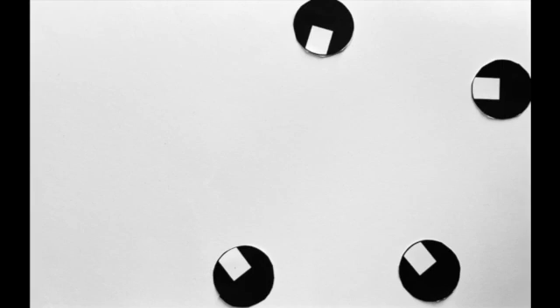In an antibody detection ELISA, lab-purified antigen is added to the wells first. In this model, the solid black circles represent the coronavirus S protein antigens. The first step of the antigen detection ELISA allows us to determine whether a desired antigen that would indicate infection is present. The first step of the antibody detection ELISA would allow us to determine whether a patient has antibodies present for a specific antigen introduced to see if they have had previous exposure to the pathogen.